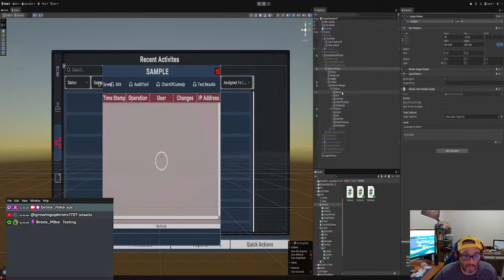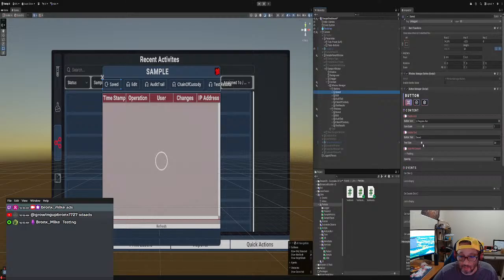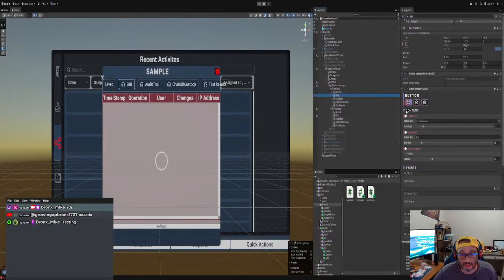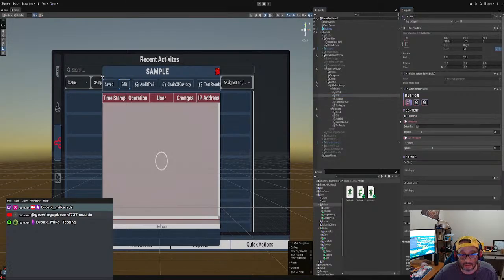Okay, so I think we should make the button fonts a little bit smaller. Sorry. Enable icon. No icons. We don't need icons for this stuff. You already have it with a title, so they don't need icons. You could just turn off the icons here, right? And now we could actually fit all the buttons for that. Your other option is spacing and text size. All right, and you could do that as well.